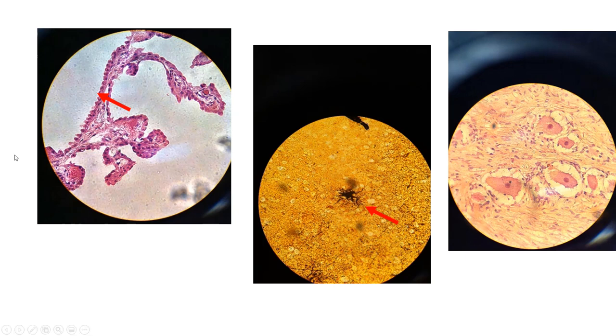All right, so moving on to some microscope slides. So these are ependymal cells. And so this network of cells is called the choroid plexus. And do you remember they have cilia? The purpose of these ependymal cells is to produce cerebrospinal fluid. And this choroid plexus is located in the ventricles of the brain and central canal of the spinal cord. Here's a microscope slide of an astrocyte. Remember, the astrocytes form the blood-brain barrier.